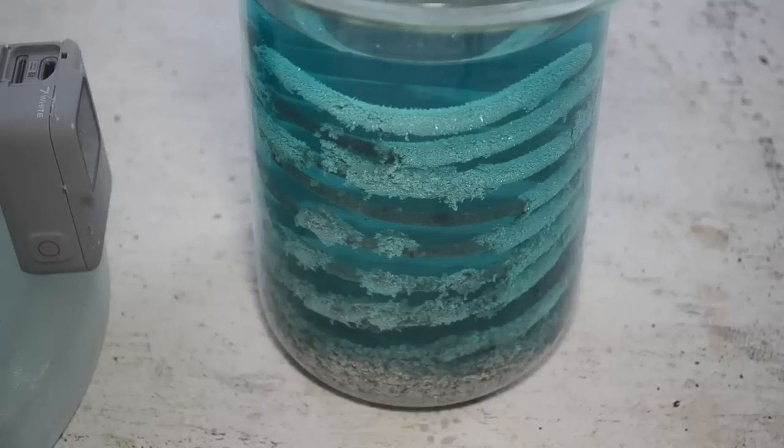But I know from experience that you got to let this go for quite a while, because even after the fast cementation stops, this will keep going on slowly for quite a while afterwards. So I will definitely let this go until sometime tomorrow, at the very least.